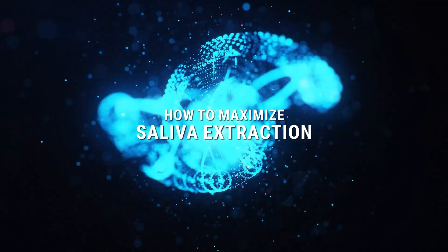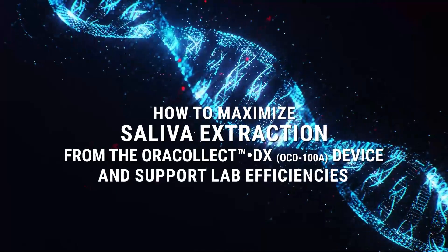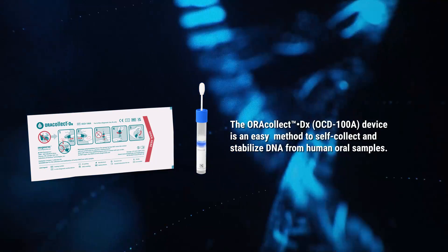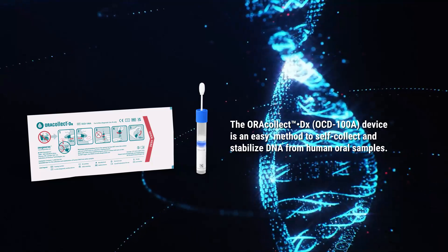How to Maximize Saliva Extraction from the ORAcollect Dx Device and Support Lab Efficiencies. The ORAcollect Dx Device is an easy method to self-collect and stabilize DNA from human oral samples.